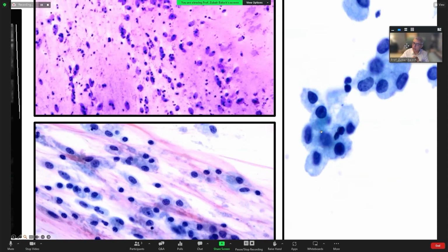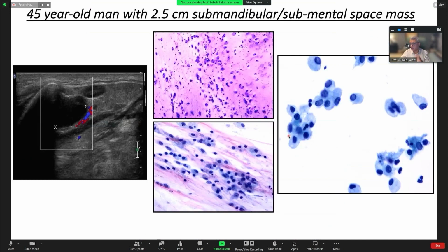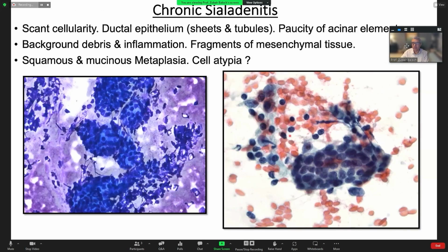This issue can get complicated if they are infected, and in those, you may develop a little bit of a squamous metaplasia. But having that stringy mucin and only these cells which look like histiocytic type cells, then you can be assured, combined with radiology. Remember, you're not working in a solo practice. I'm sure some of you are. But if you have radiology available, ask the question, could this be a ranula, when you're not seeing those 3 cell types.